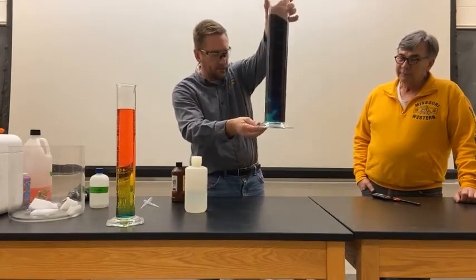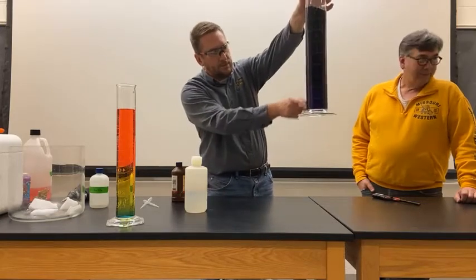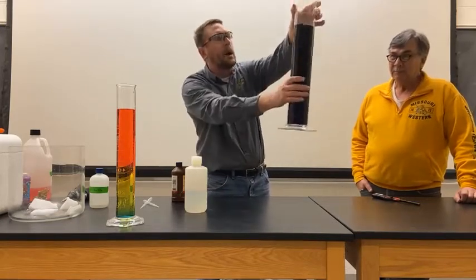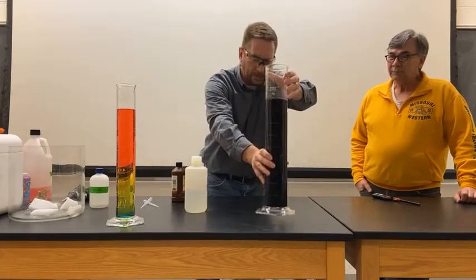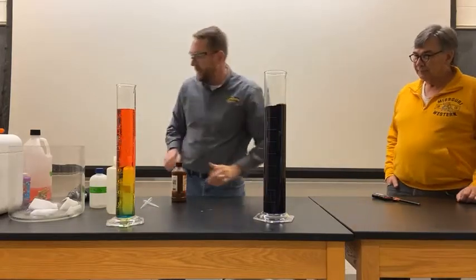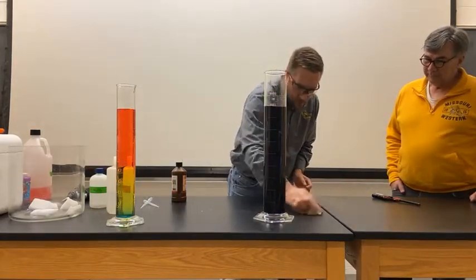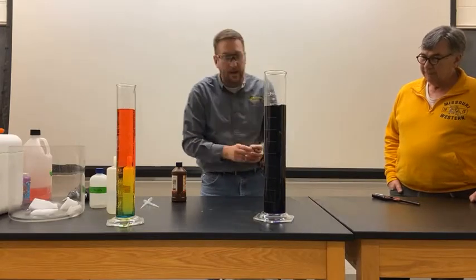So you can see, oops, I got a little spill there. All right, so now I don't know if you can tell, but it's starting to turn a nice purple color all the way through, because that little bit of sodium hydroxide that I added has made it basic. So the thing that we're going to do next is add some carbon dioxide to this.